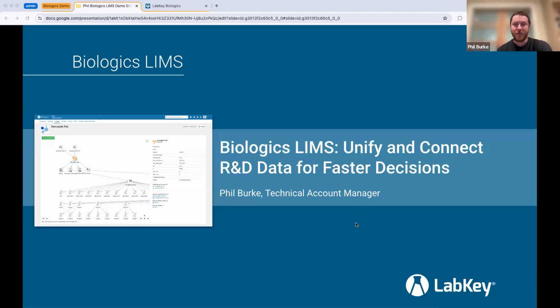So today my plan was to spend a little bit of time talking about some of the problems that people typically encounter when they're working with R&D biologics discovery, and some of the things that we're aiming to solve with LabKey. But for the bulk of this webinar, what I'm actually going to be doing is just jumping into LabKey itself and showing you what's possible with the software.